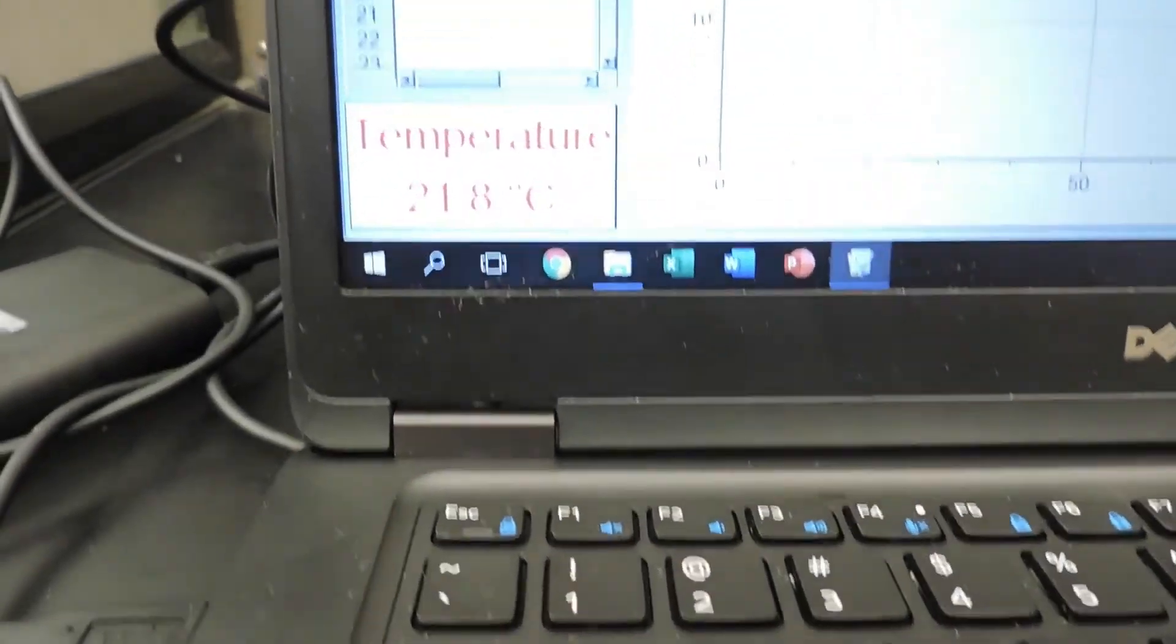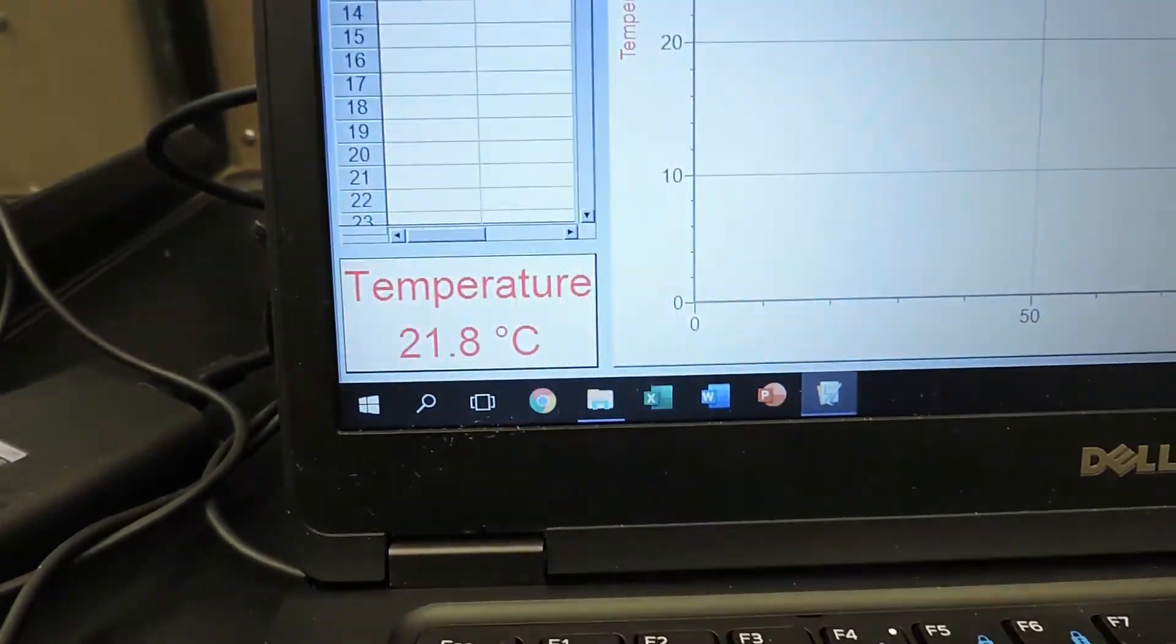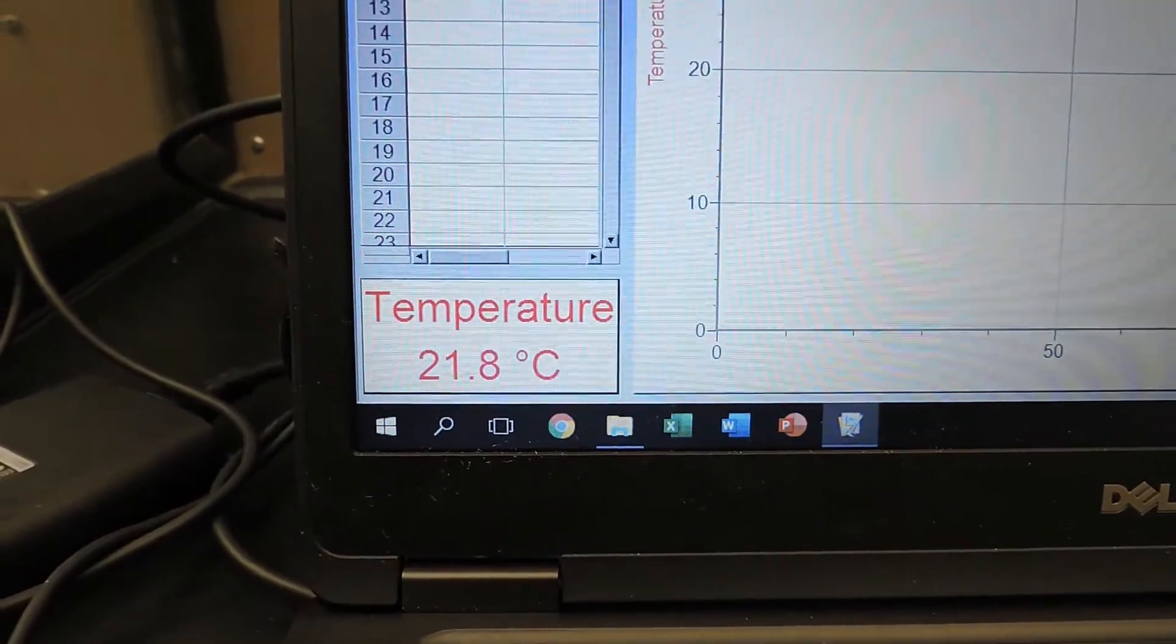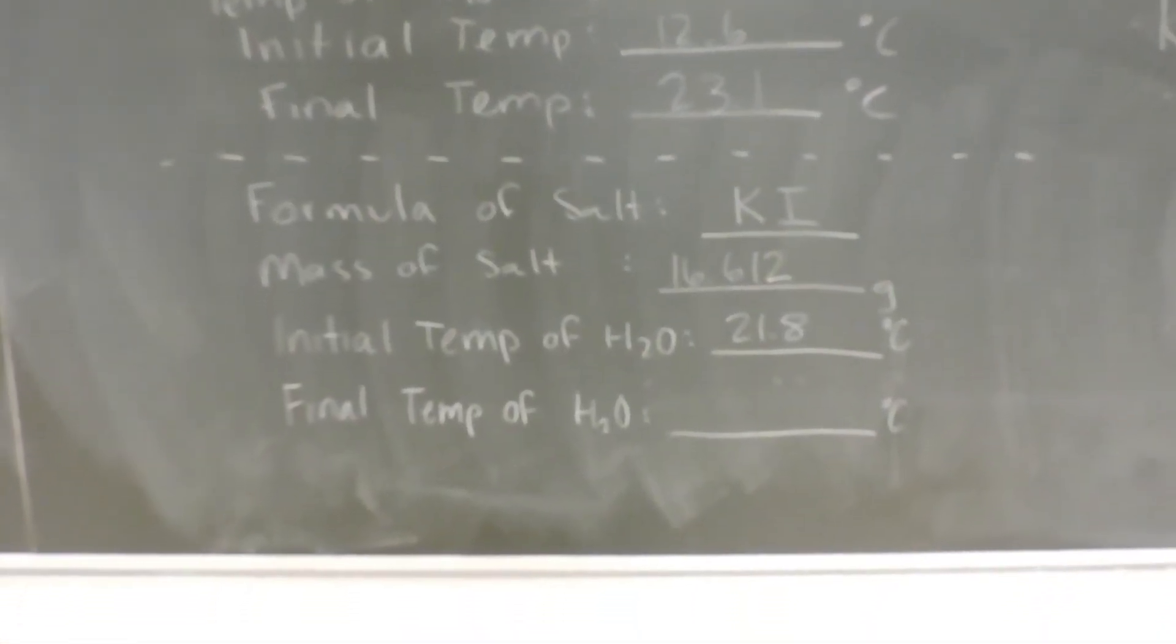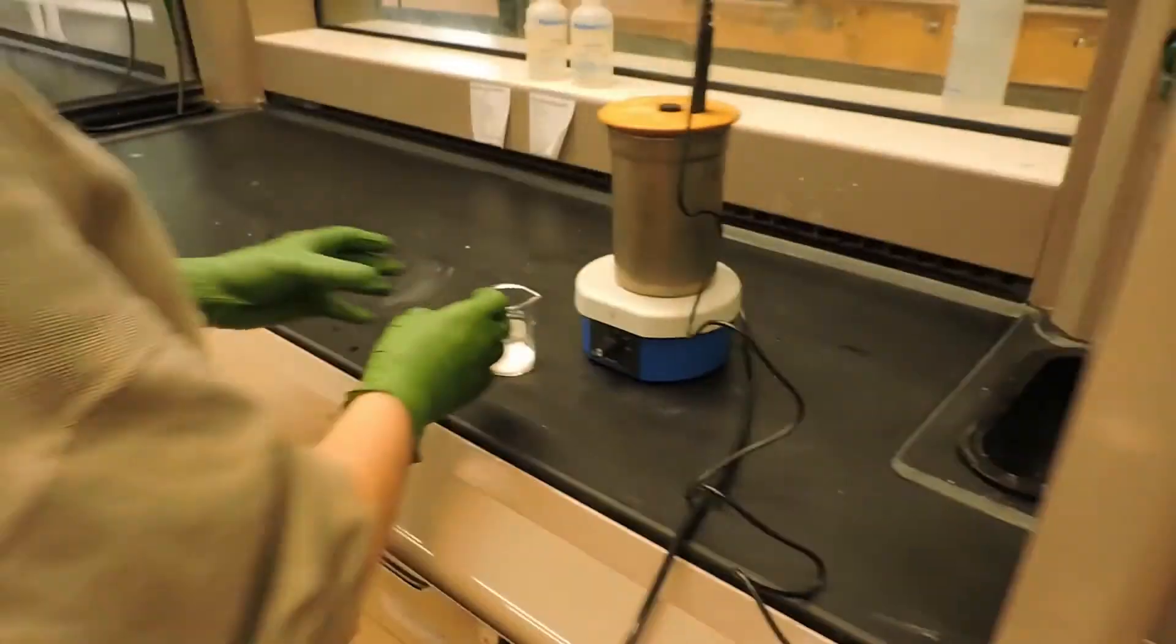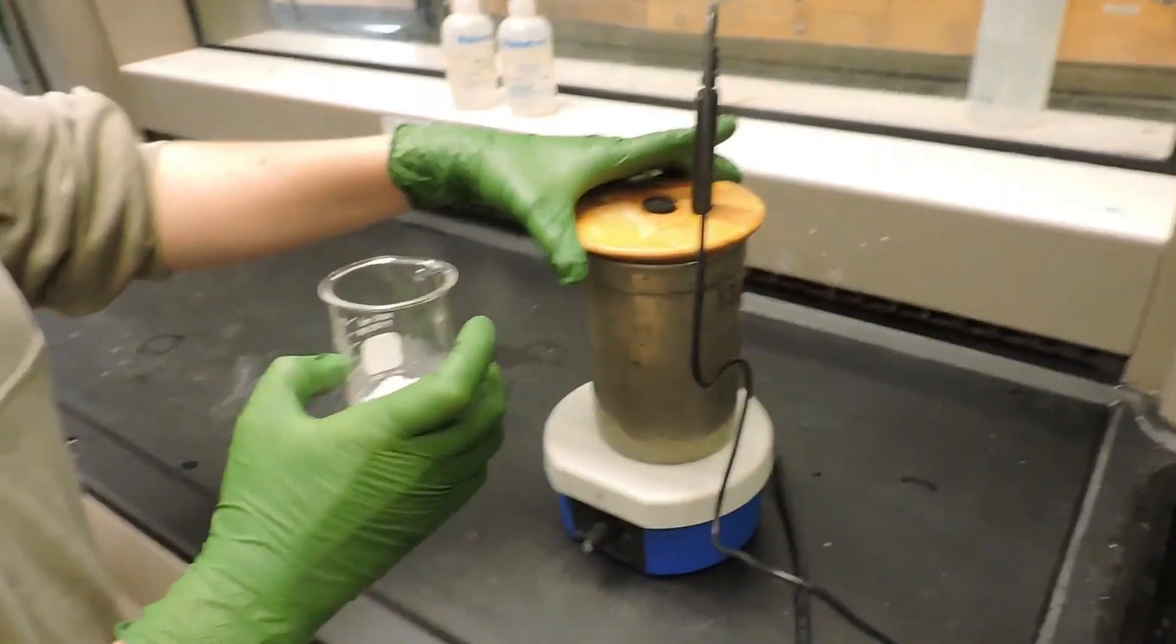It appears our initial temperature that the calorimeter is set up to stabilize at is 21.8 degrees Celsius. We will now begin collection and add potassium iodide to the stirring calorimeter.